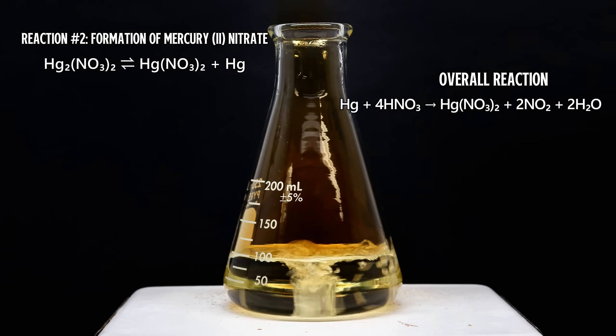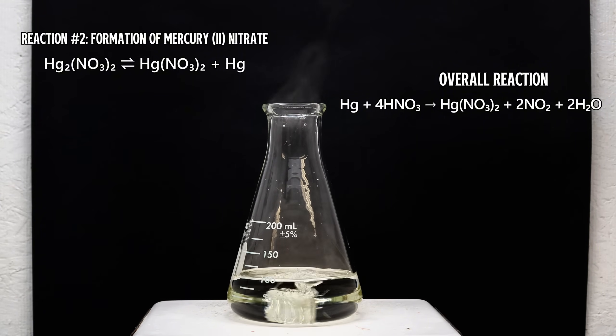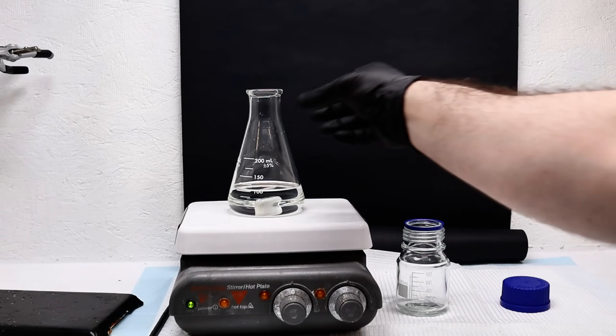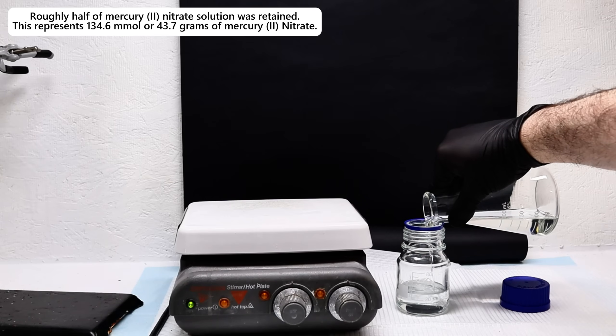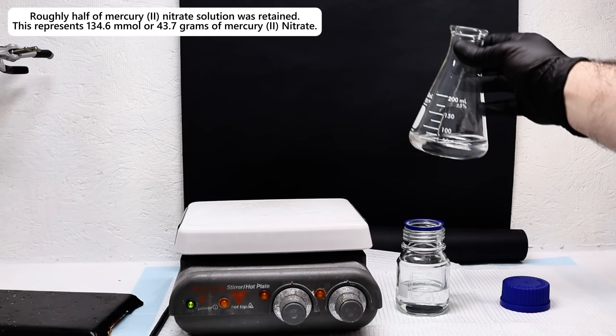With that being said, as long as scary red NO₂ gas is being produced, there's still some mercury-1-nitrate hanging around. And once they do finally stop, it means I've finally made pure mercury-2-nitrate. At this point, I had almost exactly 100 milliliters of my mercury-2-nitrate mixture, and given how much mercury I started with, this means I should be right around 2.7 molar.